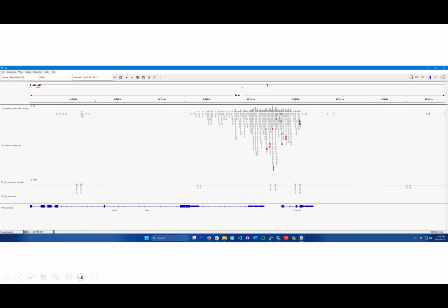So this gives us some confidence that what we're seeing isn't just background. There are certain regions of the genome that are more accessible or are known to give you a little bit of a peak with IgG. So you just want to have that to give yourself some confidence that it's not just that you are looking at a really accessible region and you would always see sequencing reads from there.